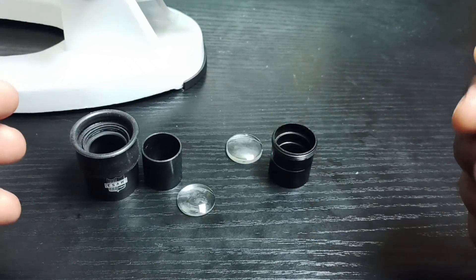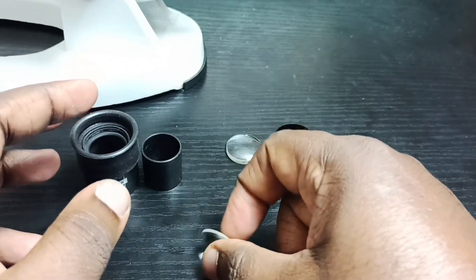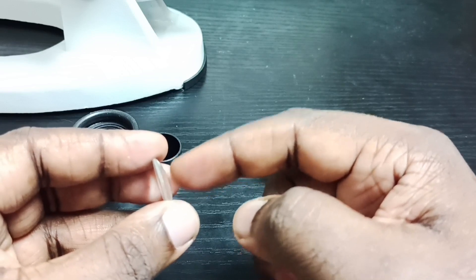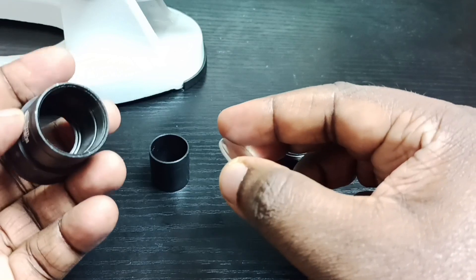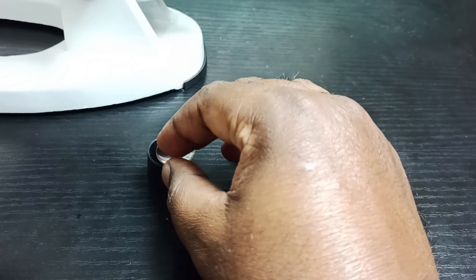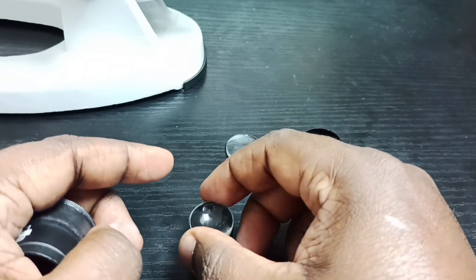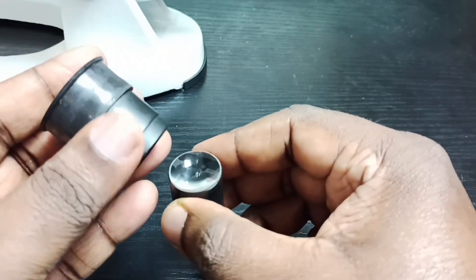After cleaning, first we have to put this lens back. If you take this lens, you can see it has two sides — one side has a bulge, and that side has to go inside. The bulge part you can place on top of this plastic.